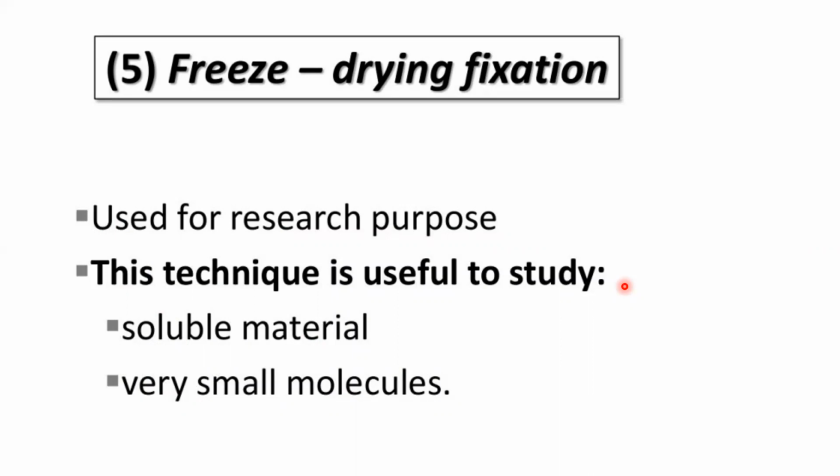By subjecting it to very low cryo temperatures, we can freeze the tissue instantaneously, so that all enzymes, proteins, lipids, subcellular matrix proteins, everything will be preserved in their lifelike state without even altering the peptide structure. In freeze drying, there won't be involvement of any fixatives. It is a direct freezing of the components in their state. That is the major idea of freeze drying fixation.